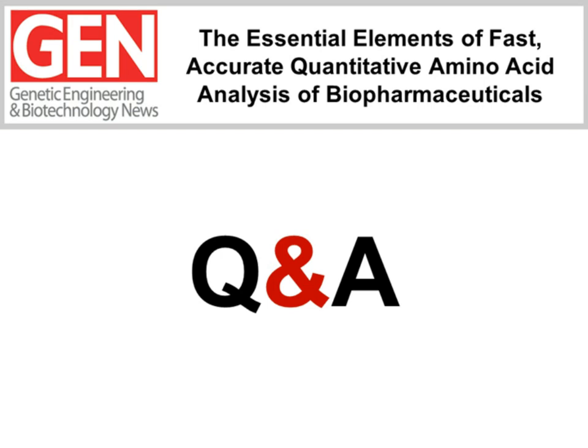So we have some amino acids that go down with time, some amino acids that are likely to go up with time. For a very, very long time, it's been an accepted practice to do the hydrolysis for 3 time periods, and what we've generally used in the past for a HCl hydrolysis is 24, 48, and 72 hours.